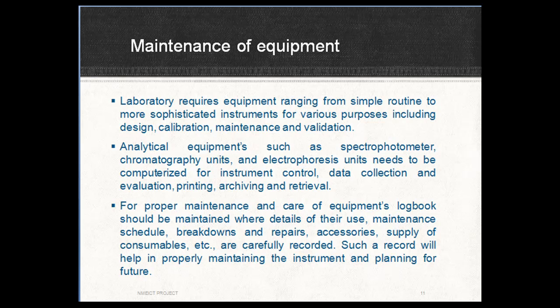For proper maintenance and care of equipment, logbooks should be maintained where details of their use, maintenance schedule, breakdowns and repairs, accessories, supply of consumables, etc. are carefully recorded. Such a record will help in properly maintaining the instrument and planning for the future.